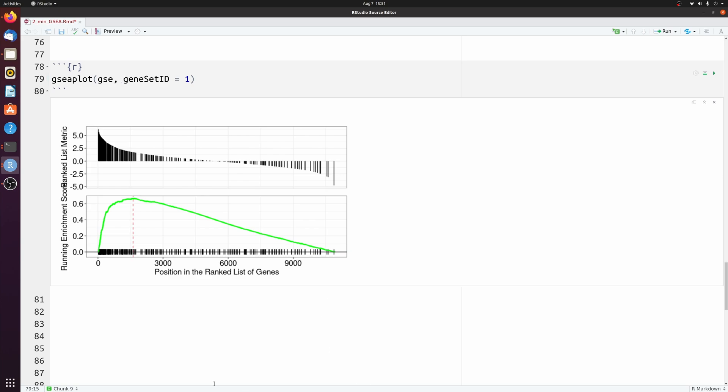So you see we have a very significantly enriched term in the upregulated genes. I'm not going to go into depth, but basically along the x-axis is the 11,000 ranked genes. And then each vertical black line is where one of those genes were found in this gene set.